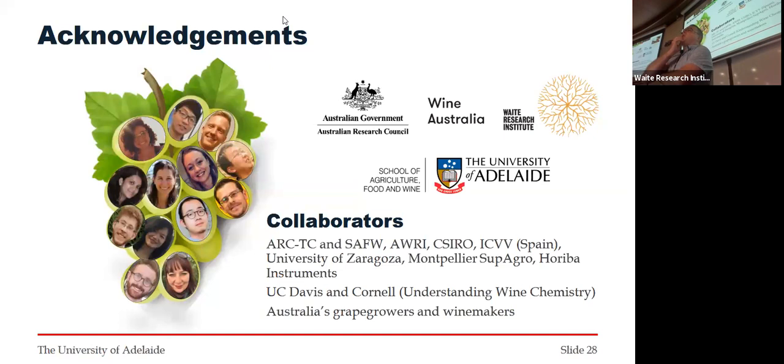At the moment, Ruchira is the auto sampler, the person doing it. So it's one sample at a time, super painful. Ruchira thinks she can do about 24 in 2 hours, so a dozen an hour, or was it 24 in 1 hour? But that's like being a robot, next thing into the sonicator, next 1 hour into the instrument, stir 2 minutes. The time for that is nothing. It's 2 minutes to read, and it's really simple sample processing, just a straight dilution and a centrifuge and sonication. But if anyone has $100 grand to help us buy an auto sampler for this, then we'll be able to power through heaps of things, right?